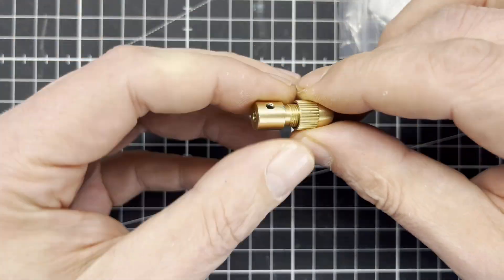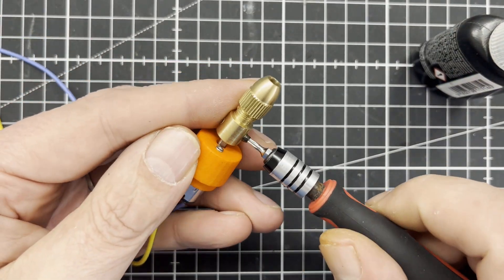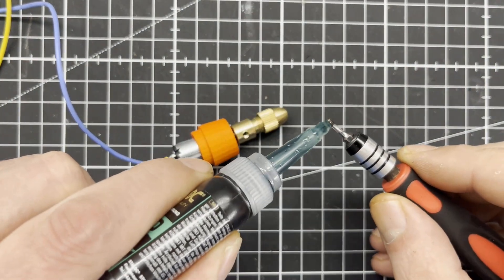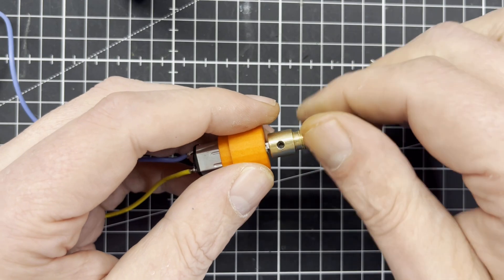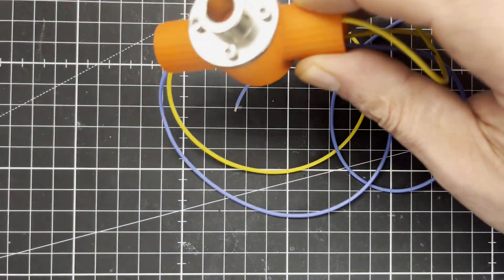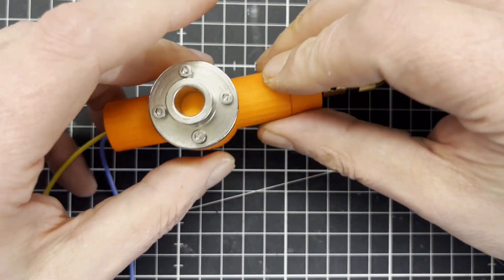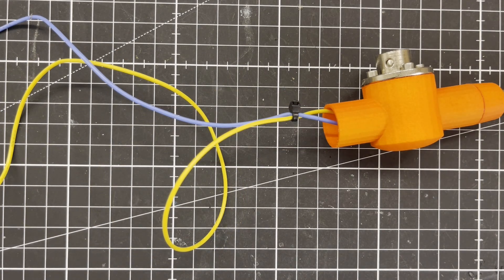You can find these mini chucks for 3-millimeter motor shafts, for example on Amazon, for a few bucks. The front and end caps are glued in with two-component epoxy resin. A cable tie serves as a strain relief.